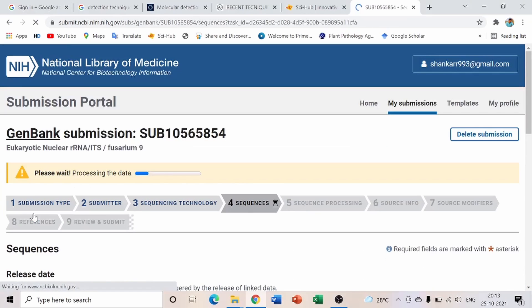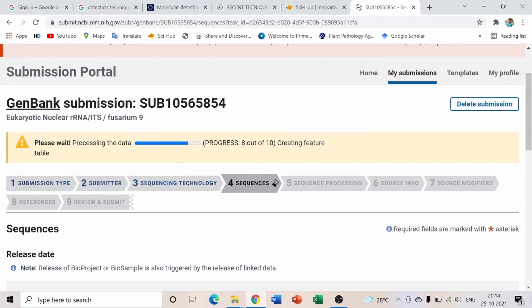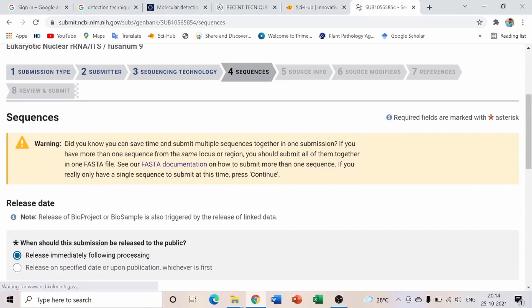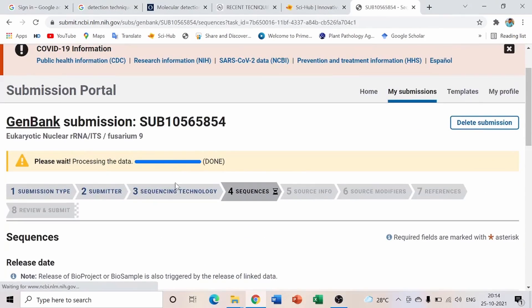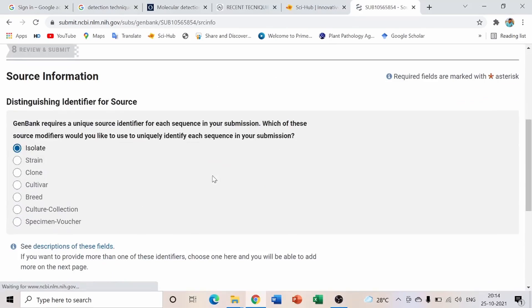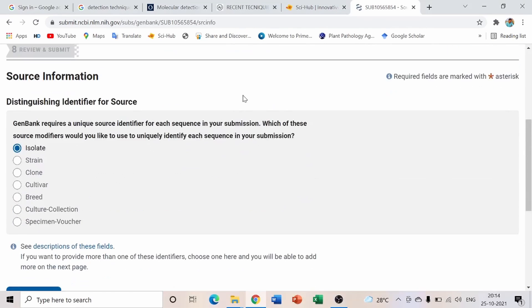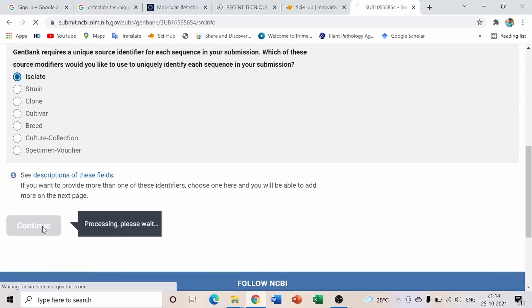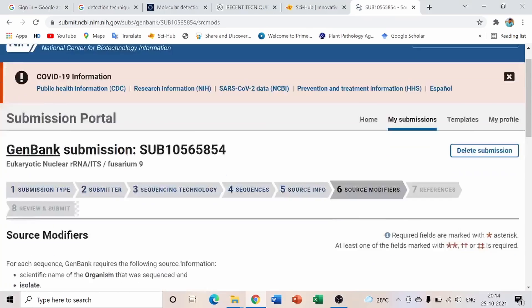After clicking Continue, it takes about five to ten seconds to process depending on your internet speed. You may see a warning — just click Continue again. It will process the data and once approved by GenBank, it moves to the next step: Source Info.